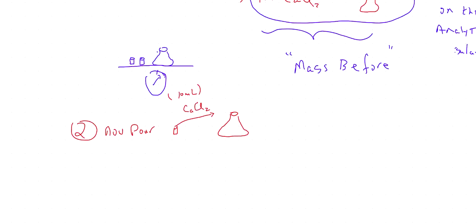And we're going to put in the sodium carbonate also. Okay, and we got this stuff together, and we're going to swirl it together. And record this. Record what you see.